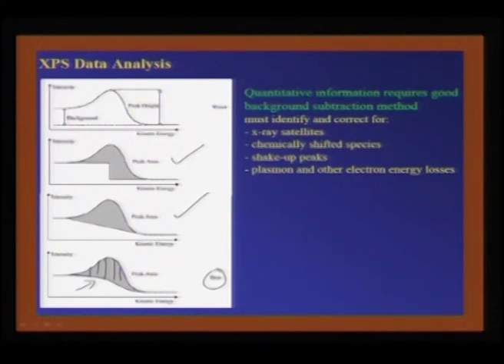So, this can prove to be a very useful technique, especially when you play with the heavier metals. More than organic samples, the inorganic samples have taken much better attention as far as XPS is concerned, and a lot more information can be drawn with XPS, and this can be quantified. So, this is one of the spectroscopies where it is not only qualitative, but it is also a quantitative picture. In the next few lectures we will also look at other spectroscopic tools which can be used for surface analysis.